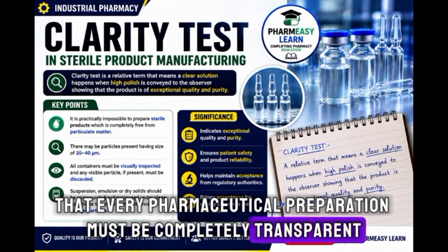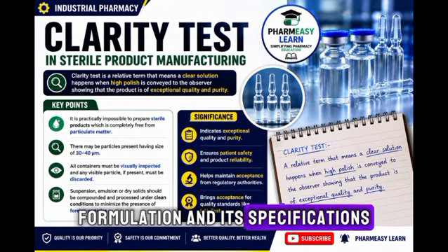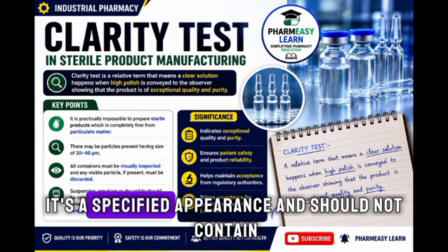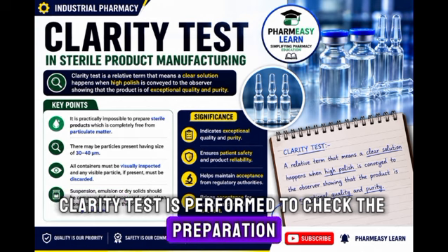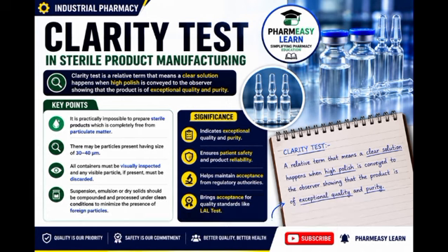One important point to remember is that clarity does not necessarily mean that every pharmaceutical preparation must be completely transparent. The expected appearance depends on the particular formulation and its specifications. The important requirement is that the product should meet its specified appearance and should not contain unacceptable visible foreign matter. So please remember that the clarity test is performed to check the preparation for visible particulate matter and an acceptable appearance.